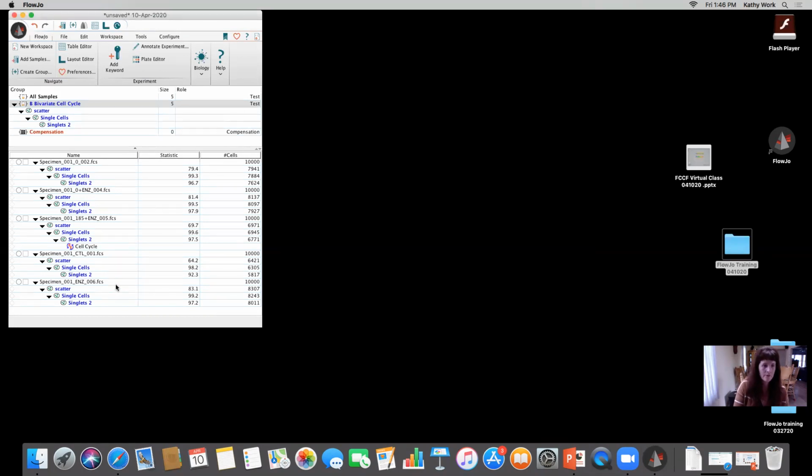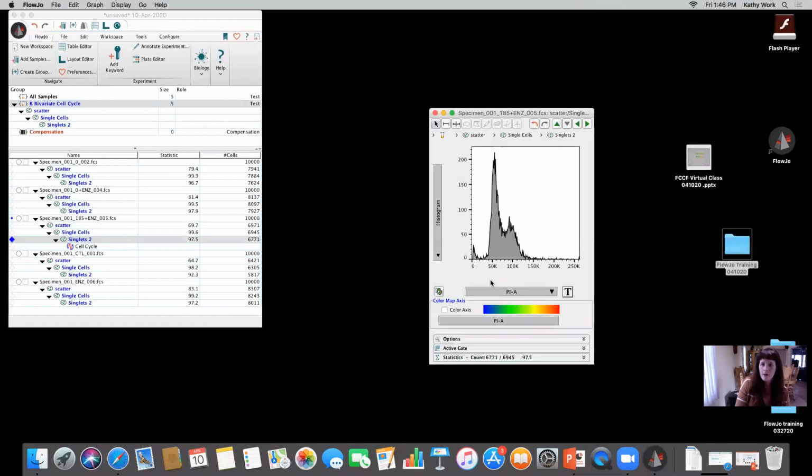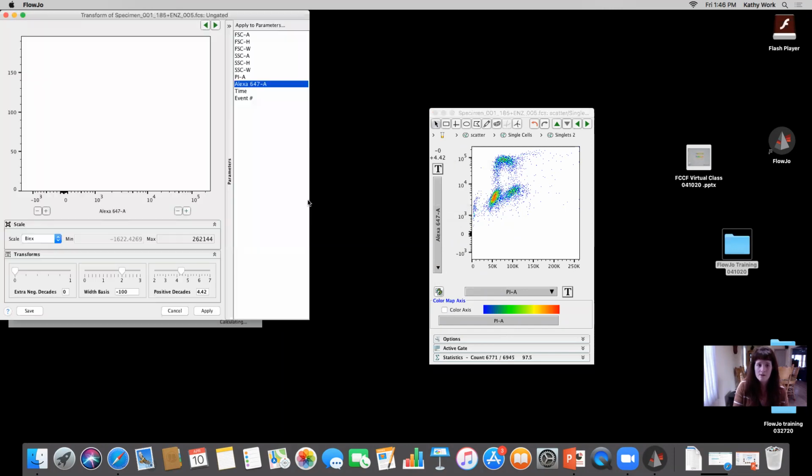Or what I can do, because I'm not going to spend too much time on this, I can open that sample up and I can look at PI. And then I told you my Alexa 647 was against BrdU. Now, what do I see here? I see something that looks much, much better, okay? The first thing I'm going to do is I'm going to use this transform button and customize the axis, okay?